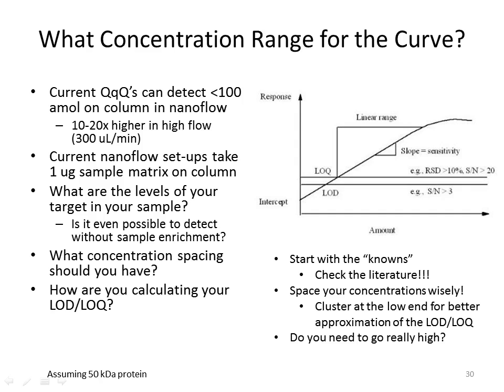So you don't just stop at the point where you say, oh, I still see it, so that's my LOQ, or that's my LOD. I've seen people do a response curve with 4 points, and at their lowest point they can still see their analyte. They say, that's my LOD. But did you go lower? No, I can still see it. But that's not your LOD. You don't know what your LOD is. You can keep going lower. You keep going until you get one point more where you can't see it anymore. Then you can at least have a ballpark of your LOD.